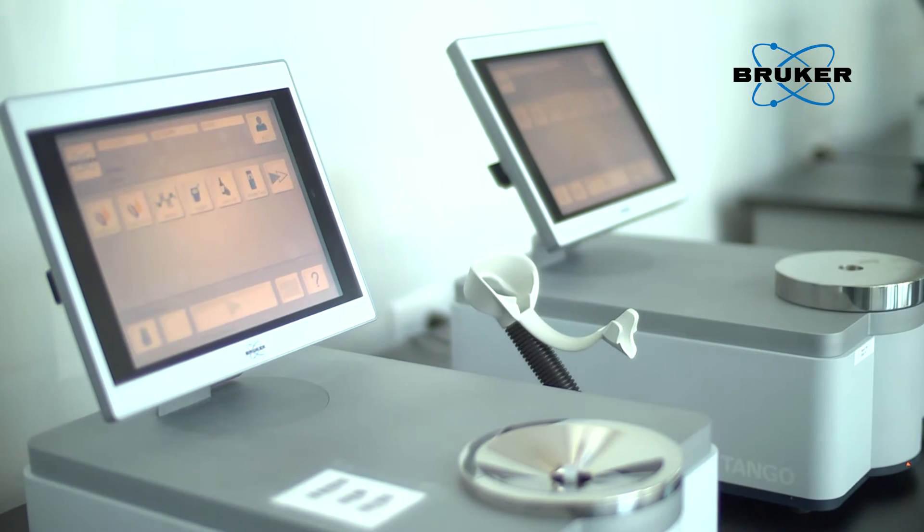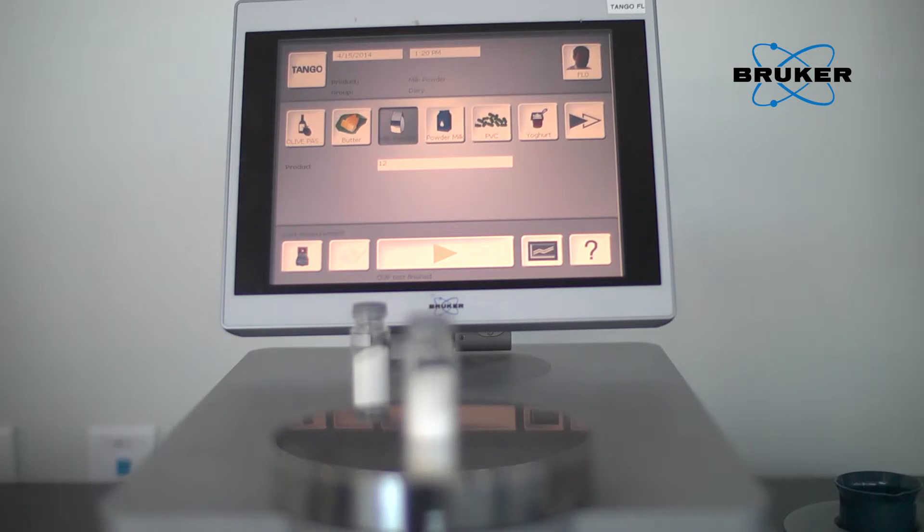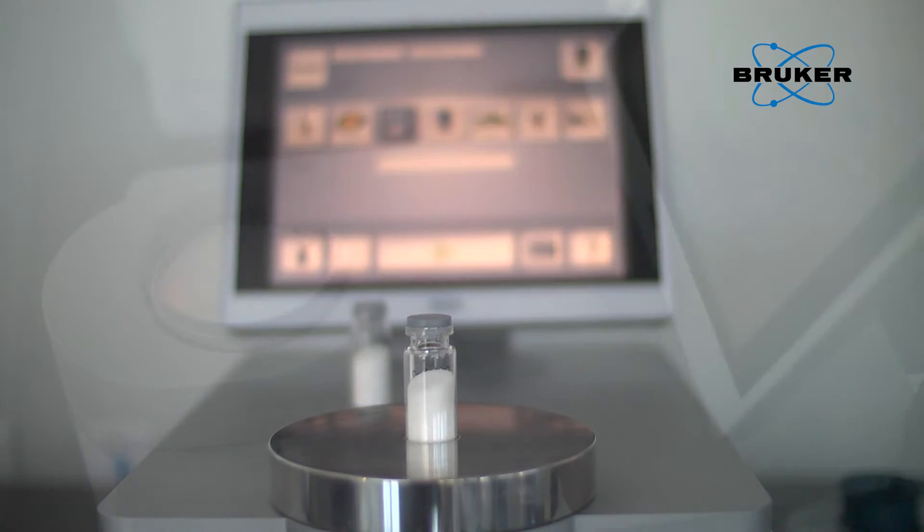The Tango T is a high-performance, rugged FT-NIR spectrometer, which enables fast and accurate analysis for measuring several quality parameters in your liquid chemicals. The Tango T comes standard with an active heating and cooling system, which monitors the vial inside the sample compartment, ensuring that your measurement is at the correct temperature. Temperature settings run from 20 degrees Celsius all the way up to 80 degrees.